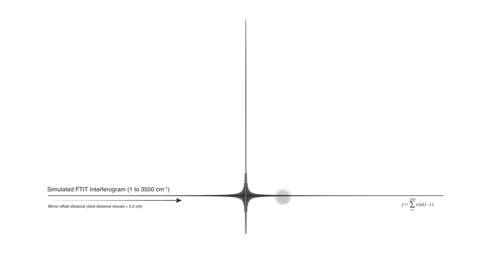Now, your instrument interferogram is not going to look like this because this is faked using Maple. Your instrument, of course, does not have the same power of light being emitted at 4,000 wave numbers as at 500. It maxes out really in power around 1,200 wave numbers and then tails off toward either end. So it's not going to look like this, but this is sort of a cartoon or an imaginary perfect world representation of every frequency in unit frequencies between 1 and 3,500 wave numbers. Now, of course, I'm not looking at all the frequencies between those frequencies because that's an infinite number and I will only live so long. My computer is slow.